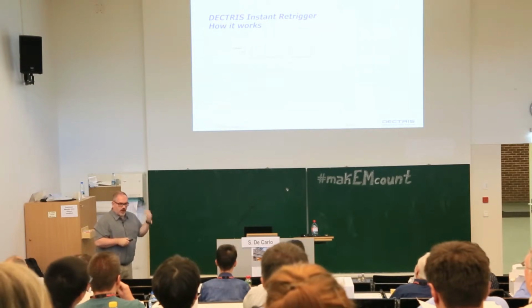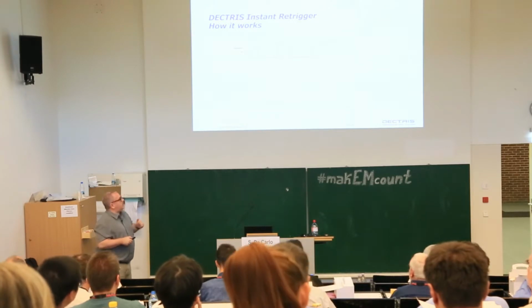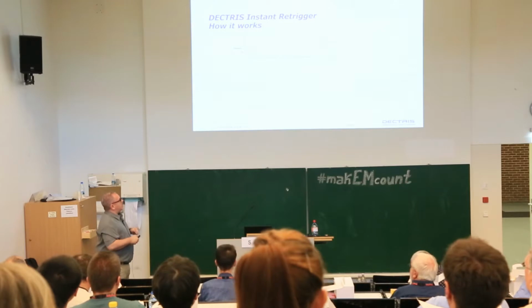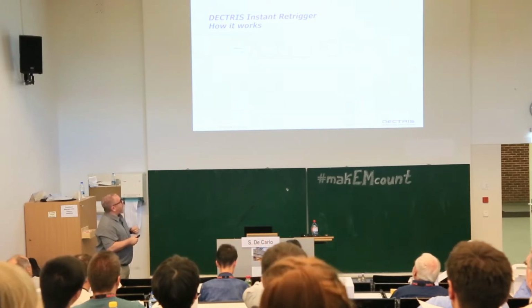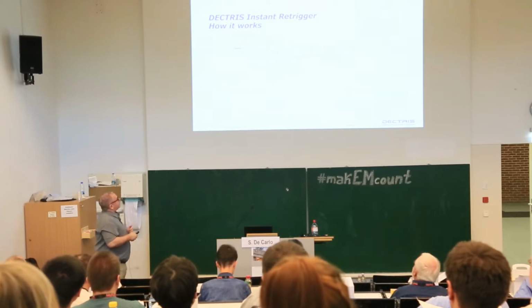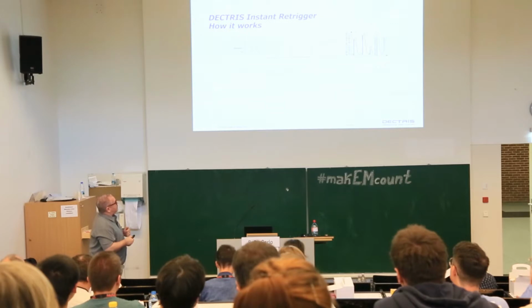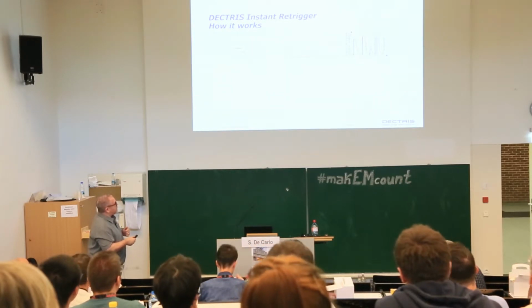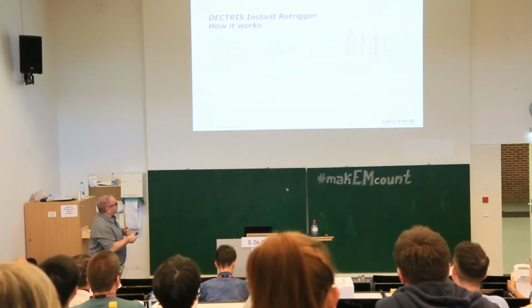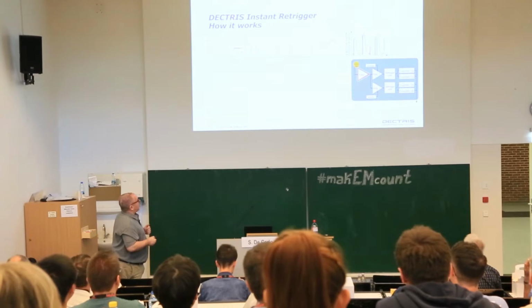You have a high influx rate of photons or electrons, and the signal remains above the threshold. And that's what is called a paralyzed counter in a normal hybrid pixel counting type of chip. So you have here several events, but the counter would count 1 event here, also 1 event here, and also 1 event here. So we are losing counts at very high count rates.